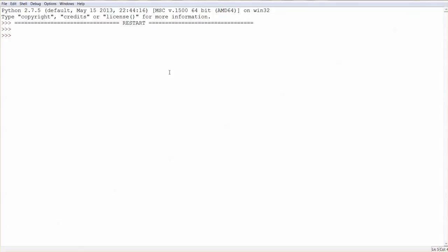What I have here is two Python dictionaries. So I've got this dictionary called mRNAs. You can search for any gene name you want. These are human genes. And there's going to be a list of lists. The first entry will be some very useful information. So you've got the name of the gene, you've got the Entrez ID, the chromosomal location, and gene synonyms.